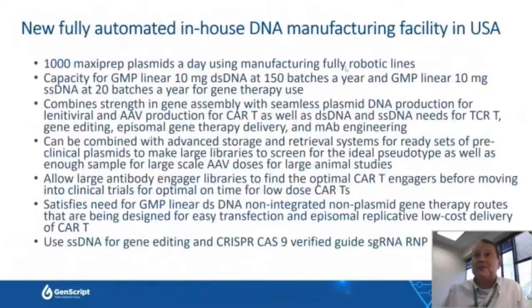What does that production facility look like? Well, if you are to make 1,000 maxi preps a day, it can be daunting. But what we've implemented is manufacturing robots rather than laboratory robots. Manufacturing robots, you know, typically the kind of robot you would see in assembly lines making anything from cars to cell phones are very robust. The lifetime for a particular manufacturing robot is on the order of 50,000 hours. That's about 5 years of continuous operation.